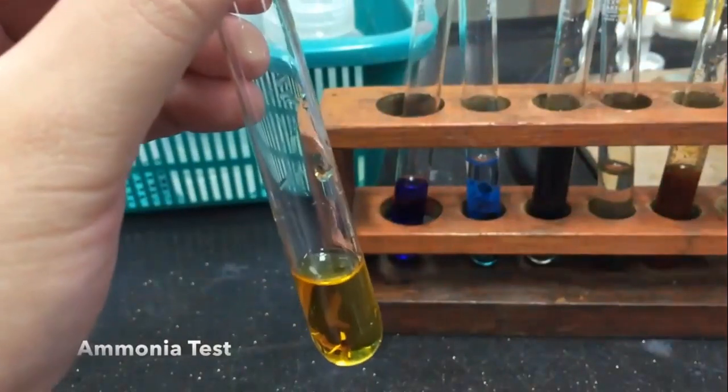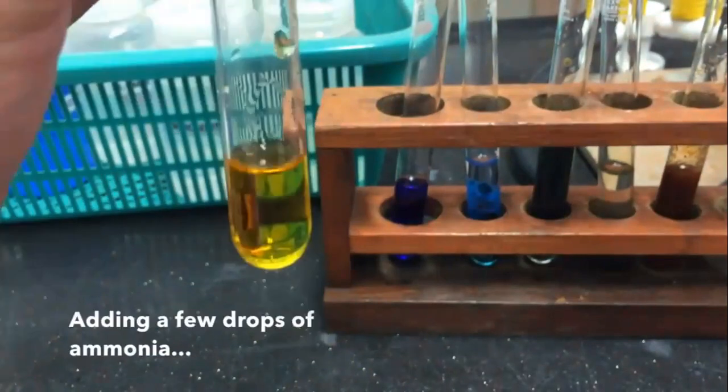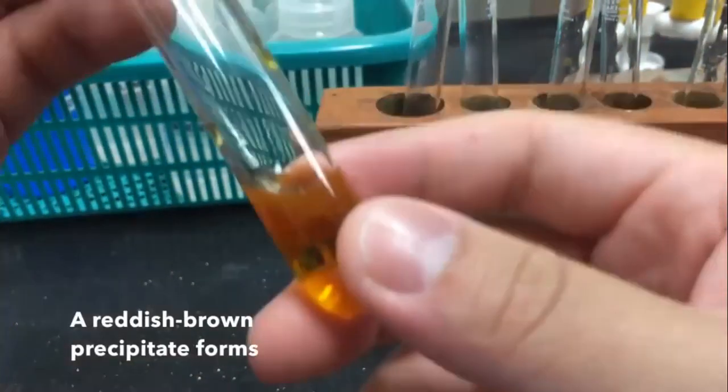Next up, we have the ammonia test. To a small sample of your solution, add a few drops of ammonia solution. Notice that a reddish-brown precipitate forms immediately.